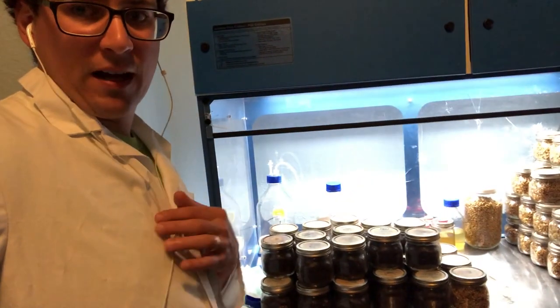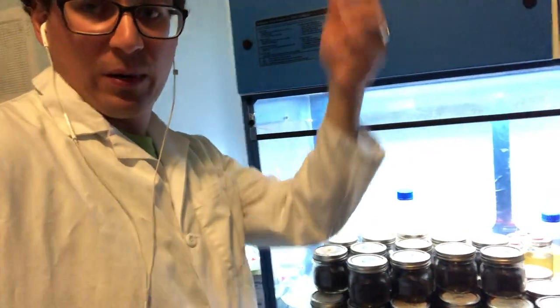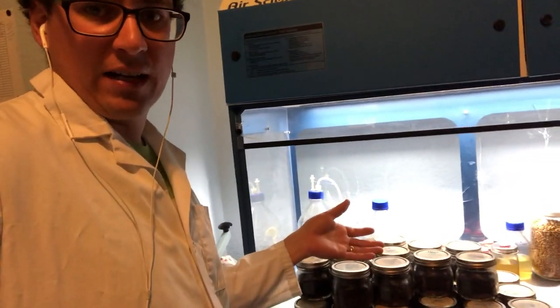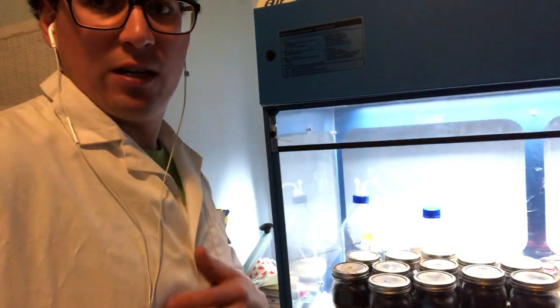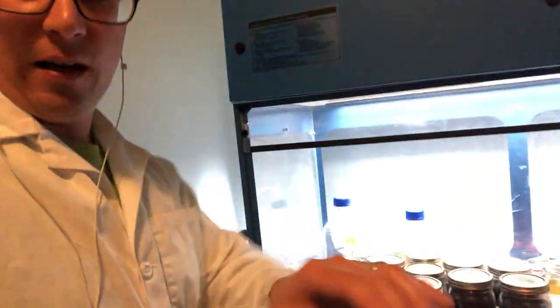Some of the problems I've had in the past by using just a pipette and aspirating from inside the bottle is that you don't get that homogeneous draw every time. So that's really advantageous if you're going to be making a lot of liquid cultures like I do pretty often, especially if you're doing a bunch of syringes of the same culture.